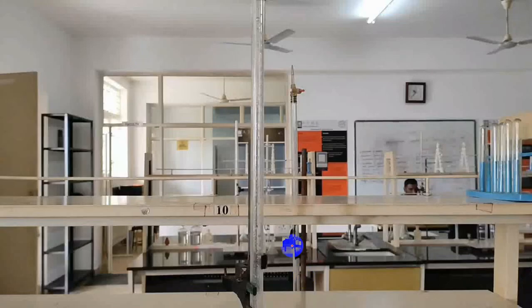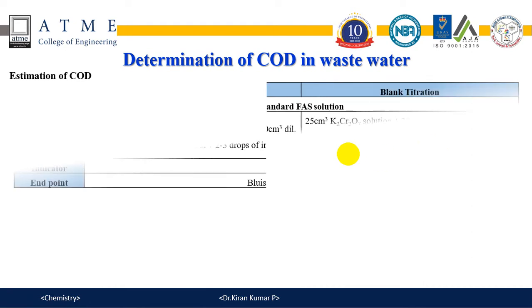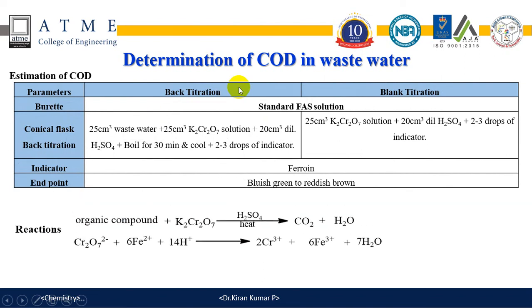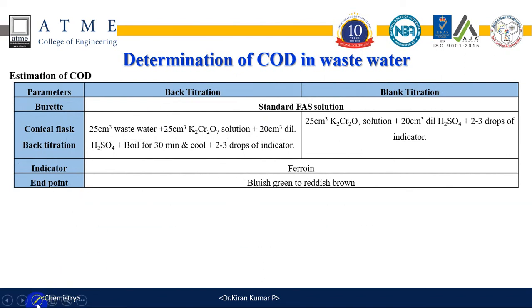Let us see the experimental demonstration first. Okay, before that, the measurement of COD has two titrations in it. One is the blank titration. Another one is back titration.